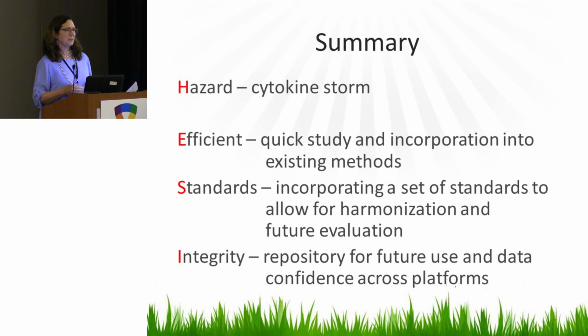So it has been done, and it can be done. First you have to find the right platform, because one of the reasons that they didn't see a difference in the response in vitro monkey to human with the CD28 superagonist was that they weren't using the right platform. So once they did, they were able to see that the monkeys were less responsive.